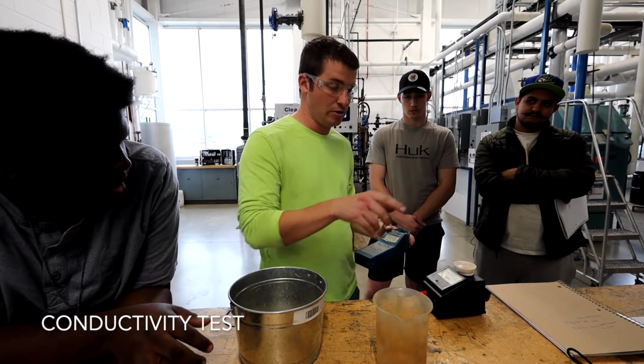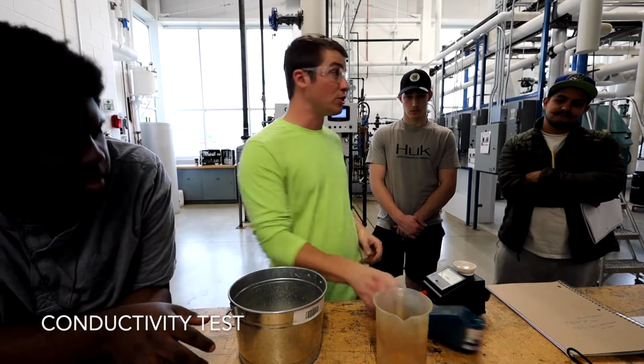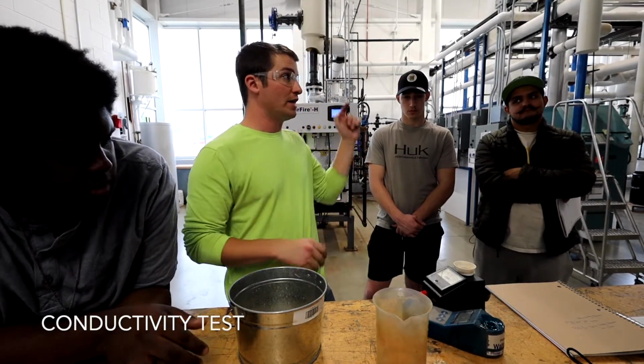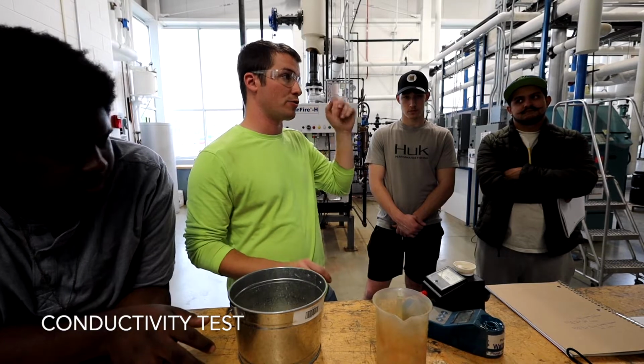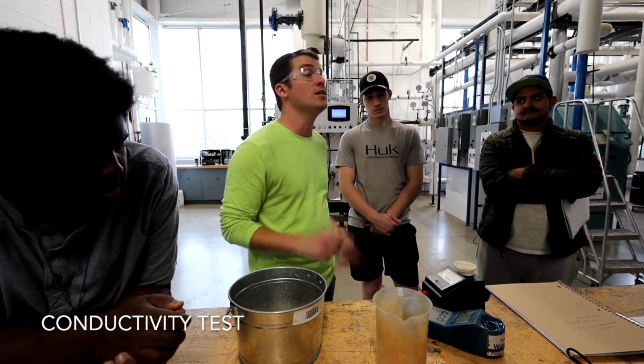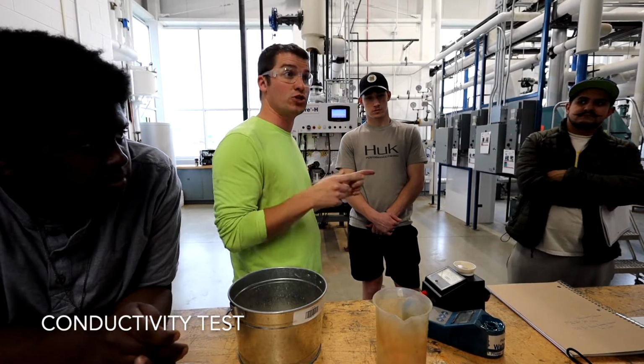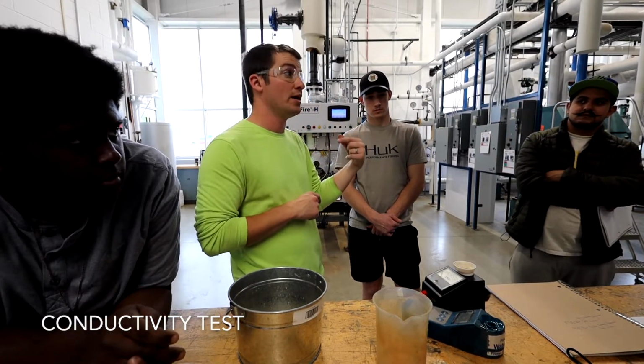So the good news is they all look to be accurate. I know mine's accurate because I calibrate it regularly. These ones are reading pretty accurately too, which is good, right? So that's good quality feed water, I would say. Incoming water, all your softener is gonna be like 300, 350. So the fact that it's 66 tells me we have more condensate in that feed water tank than actually fresh water, which is good. We wanna get as much condensate back in our system as we can.